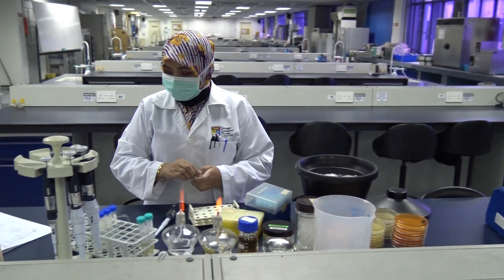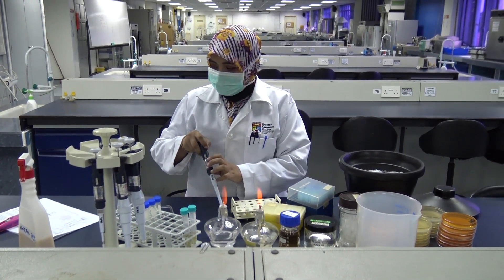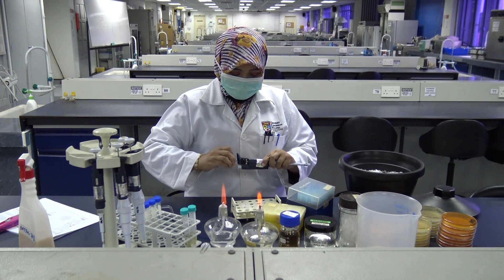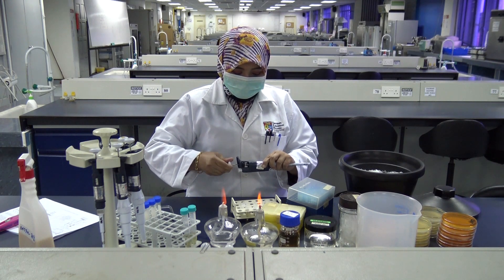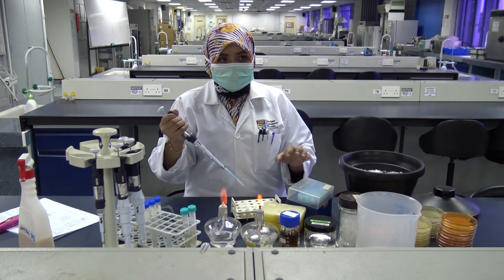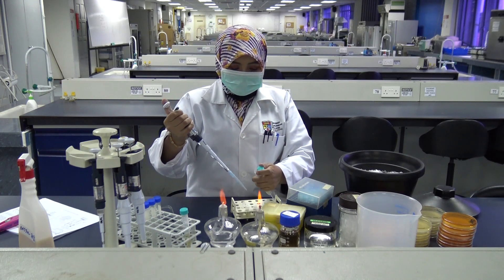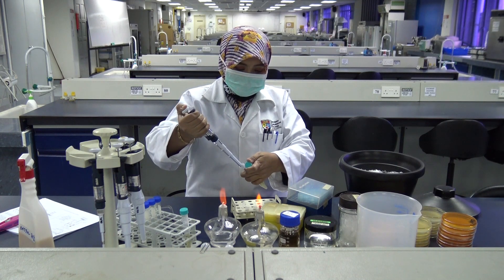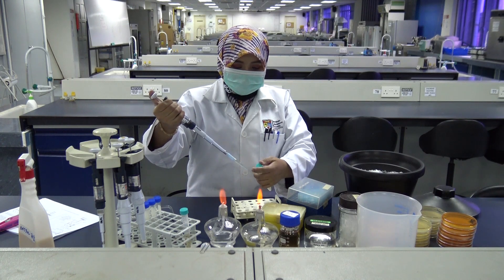Next, you are going to make your dilutions before you plate out the conjugation mixture. You are going to make two different dilutions: a 10-fold dilution, which is 10 to the power minus 1, and a 100-fold dilution, which is 10 to the power minus 2. To do this, take 100 microliters of your conjugation mix and add it to 900 microliters of LB medium.